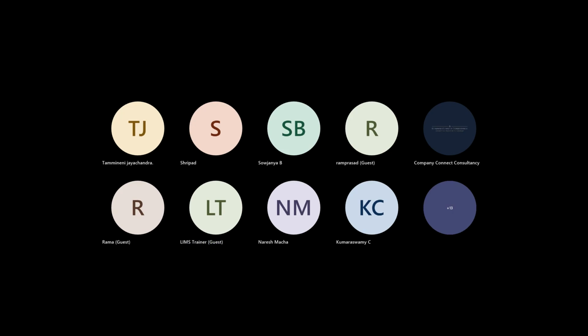I'll go into a bit more advanced. I mean, not only analyst and supervisor entering values, I'll go a bit deeper. I'll go into the modules directly, and master data, right? But you mentioned that you can share only screenshots of LIMS software. Yes, I'll be sharing screenshots, not the live one. But the same screenshots I can read in our SOPs also.